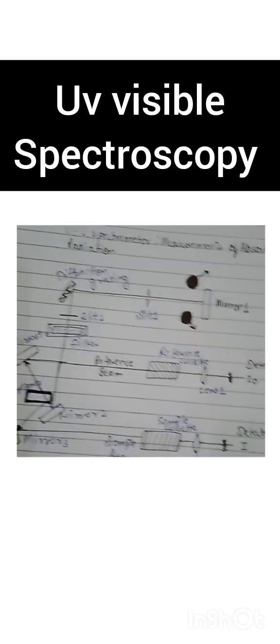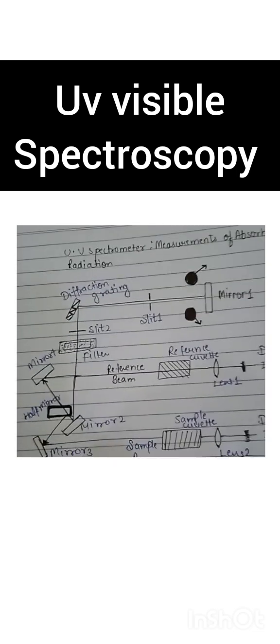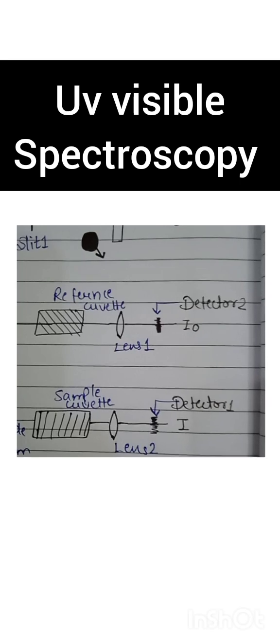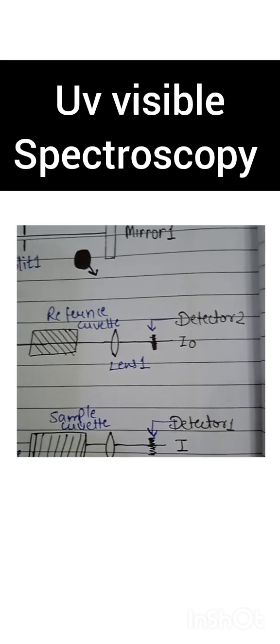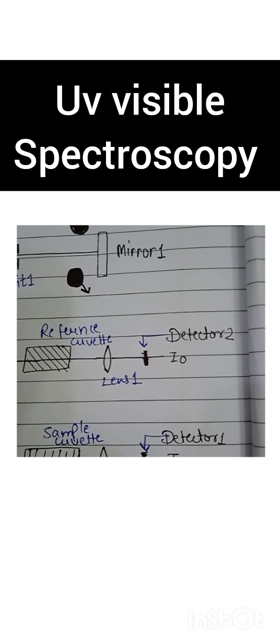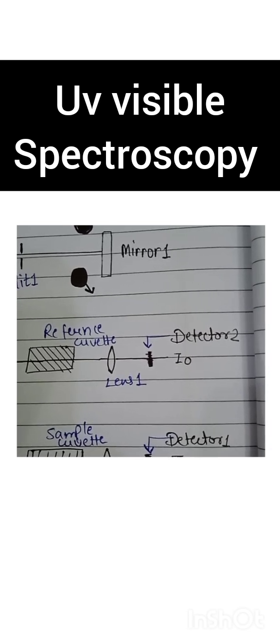Now the uses of some of them. Firstly, the uses of detectors, which is used between the lenses and the intensities. The detector converts the light from the sample into an electrical signal. Like the light source, it should give a linear response over a wide wavelength range.